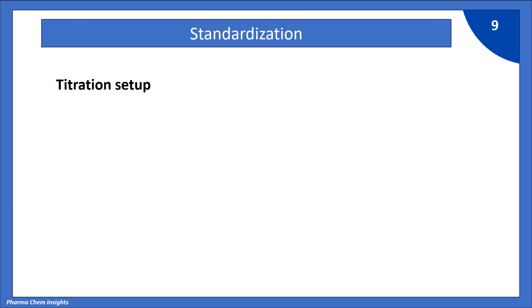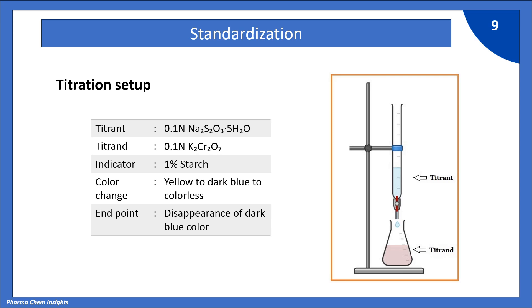Next, we will standardize this sodium thiosulfate solution using potassium dichromate. Potassium dichromate is a strong oxidizing agent and is often used as a primary standard in iodometric titration. The titrant is 0.1 normal sodium thiosulfate filled in the burette, and the titrand is 0.1 normal K₂Cr₂O₇ solution in a conical flask. The indicator is 1% starch solution. The color change goes from yellow to dark blue to colorless, with the endpoint being the disappearance of the dark blue color.